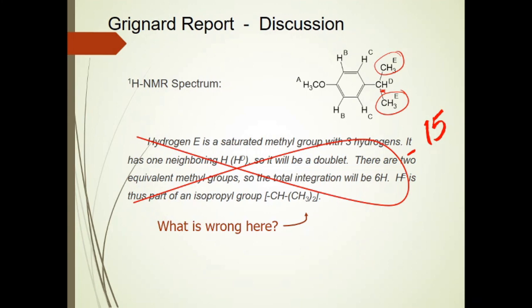And of course it didn't fit, but he tried to force it to fit anyway. He did recognize there were problems, but if he had actually interpreted the spectrum he had, he probably would have realized that he was looking at the spectrum of butyl benzoate. He would have recognized his error, and he would have then analyzed the proper spectrum.